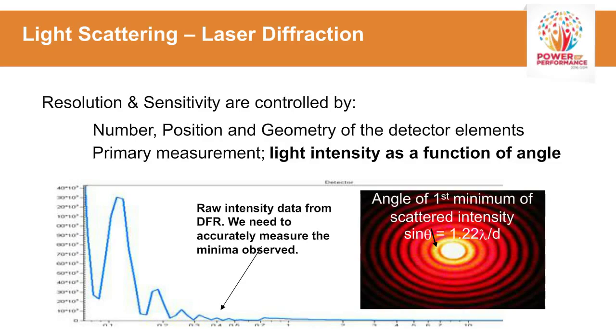The better you can define this distribution of your light scatter pattern, the more accurate the results can be. Also the resolution, and being able to determine is it bimodal, monomodal, does it have 3 or 4 peaks or a little side peak that might not be visible with some systems.